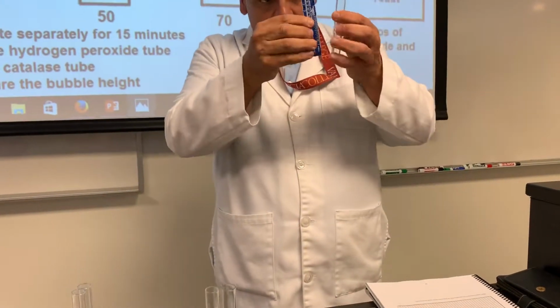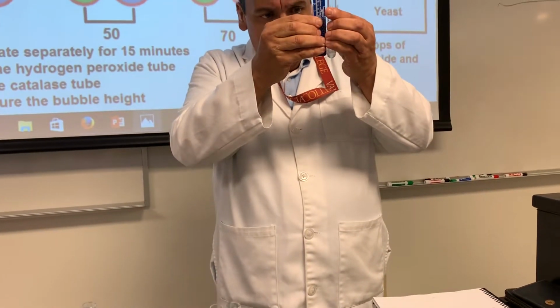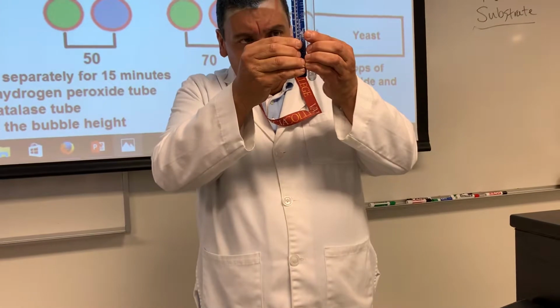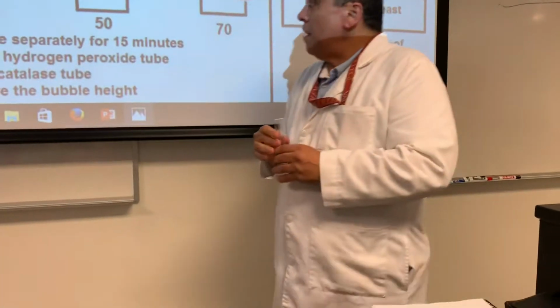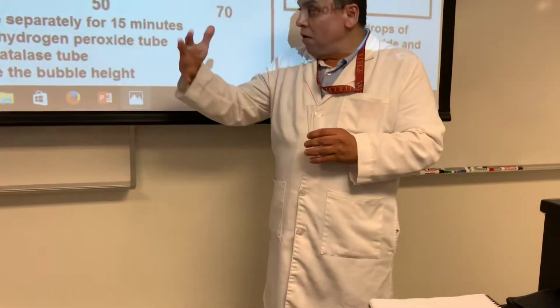What? How are we gonna measure that? I see it. It actually stayed around the same, 55. That's unusual. It stayed at 55 too. All right, so it did not denature all the way.